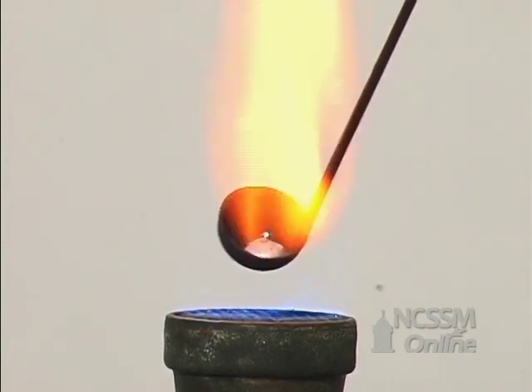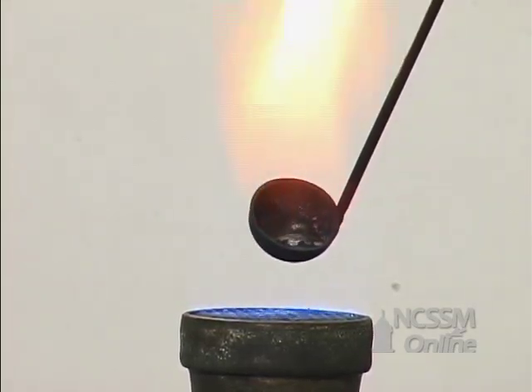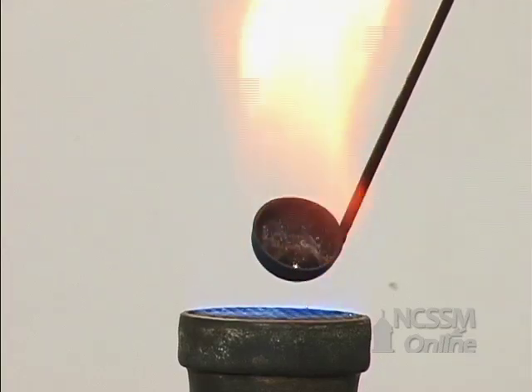If we heat a sample of sodium metal, we see that it melts rapidly. Sodium has a lower melting point than lithium.